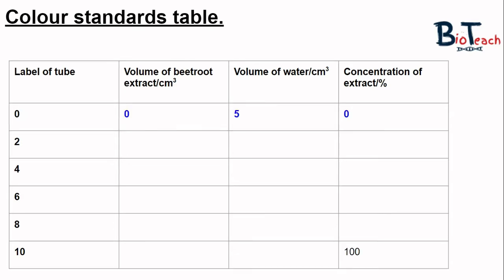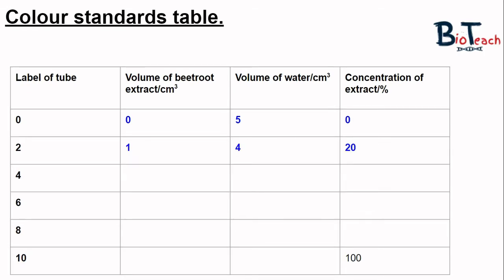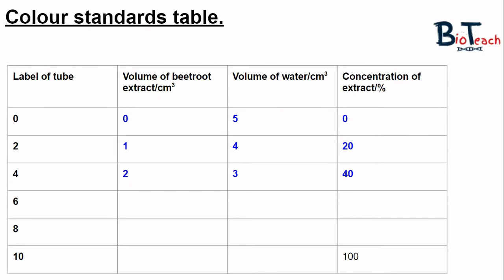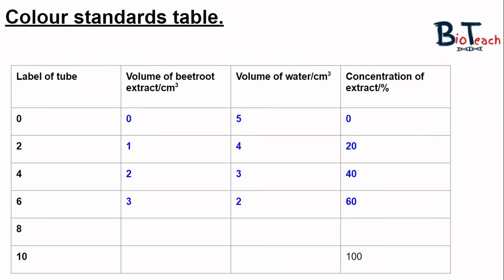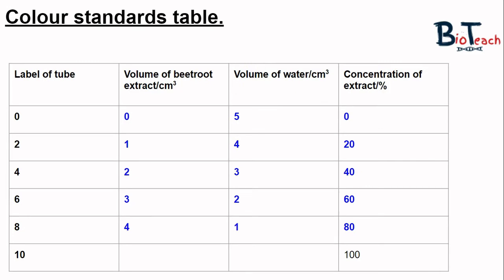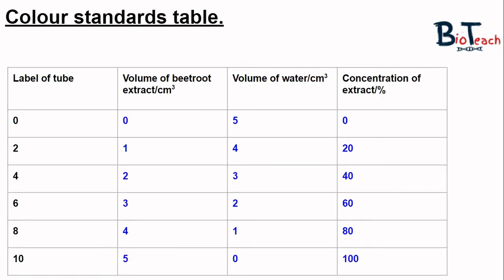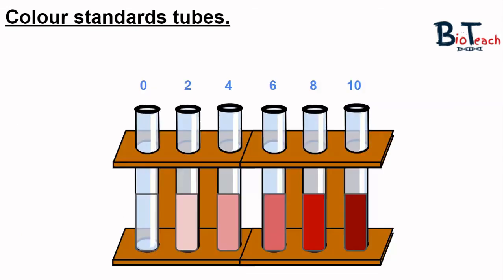To make a 0% concentration of beetroot, you simply add 5 centimetres cubed of water to the tube labelled 0 and no beetroot extract. You continue to make the following tubes for 40%, 60%, and 80%, and lastly 100%, comprised of 5 centimetres cubed of beetroot extract only and no water at all. By the time you've made these colour standards you should have a test tube rack with a colour gradient — 10 being the darkest and 2 being the weakest.